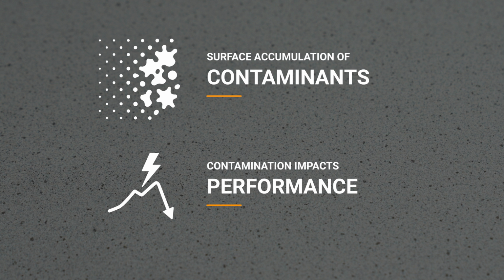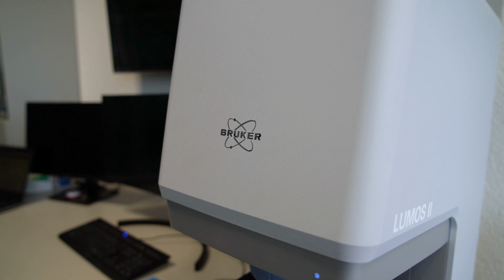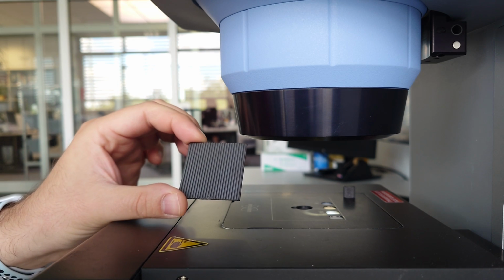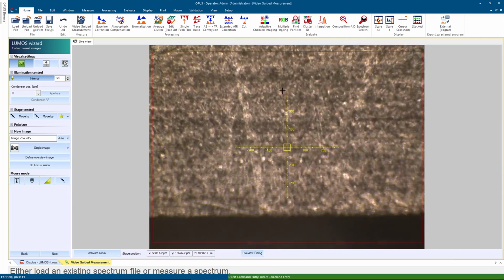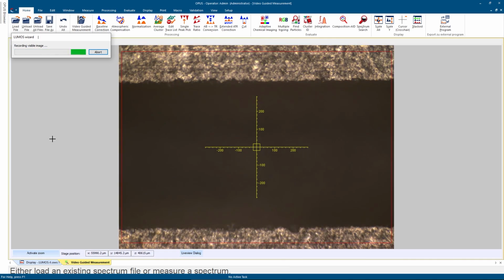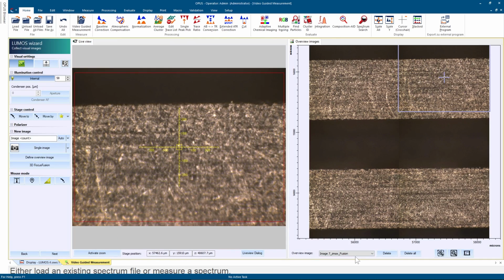and functionality. We will adhere to ISO and VDA standards to perform chemical identification using FTIR microscopy in order to trace the source of the contamination. First, a visual overview image of the fuel cell membrane is captured using the Opus software. The camera clearly reveals the membrane stripe topography. The multi-tile focus fusion function is used to generate a fully focused image along the Z-axis within the defined parameters.